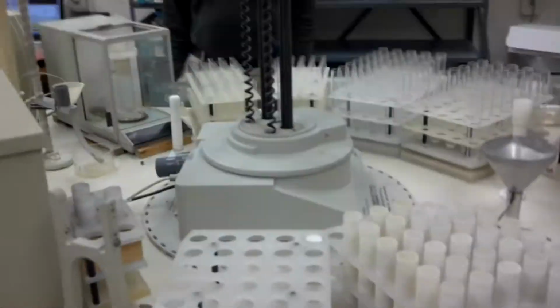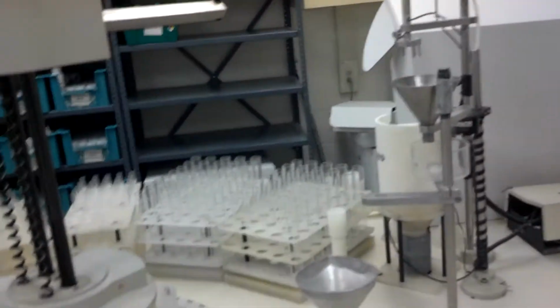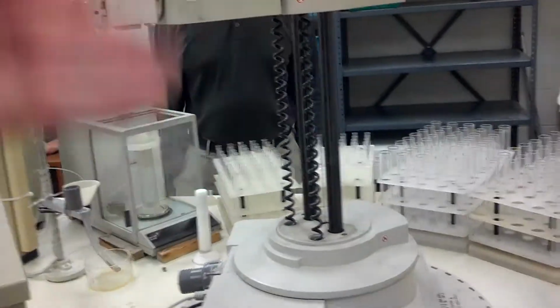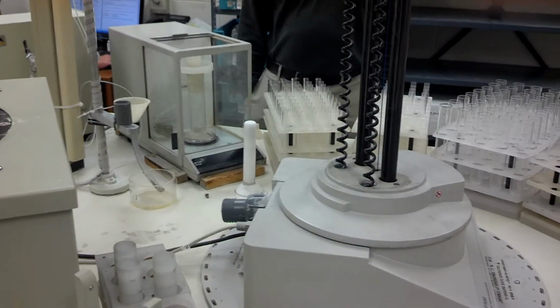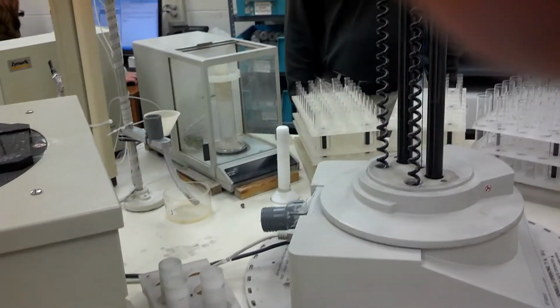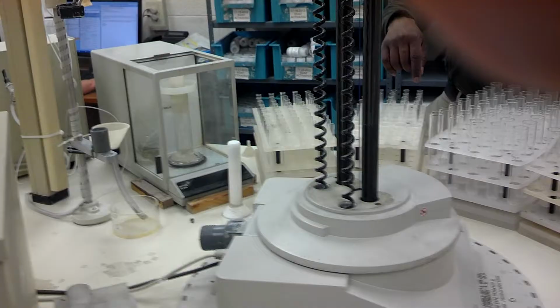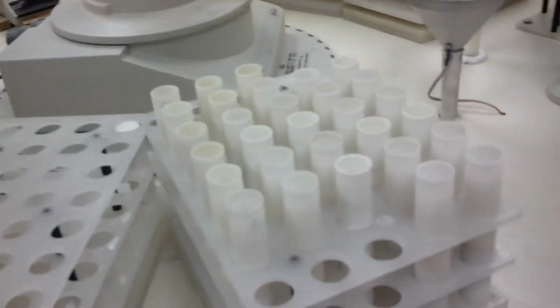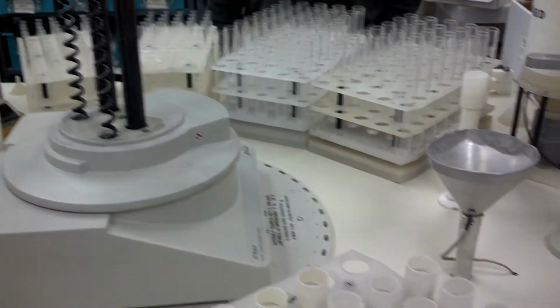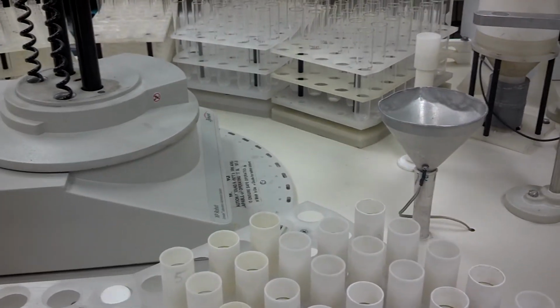Yeah. See, you've got 2 sets of these to do 2 sets of those, and then you've got to have 2 of the smaller trays because you're dumping the, what do you call that, buffer? The FCC. Splitting buffer. What's that buffer in there? Catalyst. Oh, catalyst. You call it a catalyst. Okay. Yeah. So in other words, you've got 2, 4, 6 trays. Those are where you start out. You can do 70 samples in all. What do you do with those trays? Now we have... This is for this test. We're going to show you. Oh, it's different after this test is finished. Okay. All right.